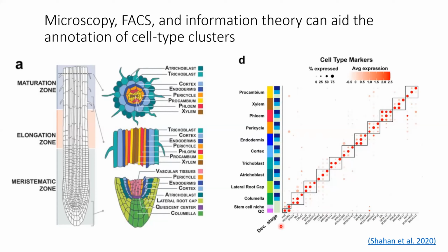So we have the marker genes on the x-axis here, and the cell type clusters on the y-axis here. And they also are able to plot 3 developmental categories within their cell type clusters. So you can see how the expression of marker genes changes across cell type and over developmental time.